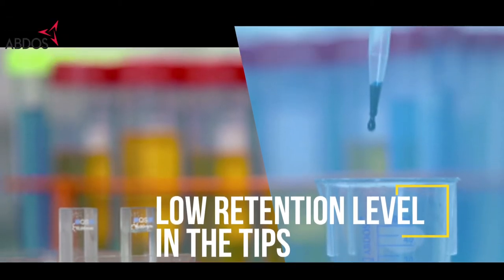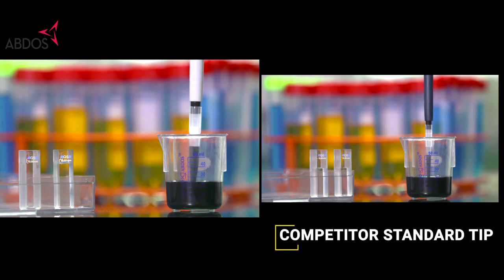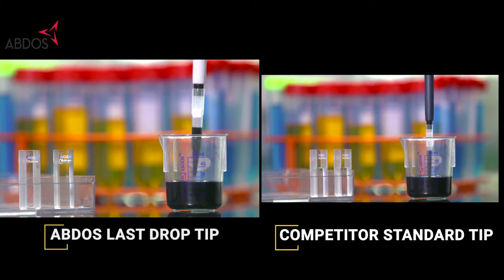The retention level is 10 times lesser with viscous samples than standard pipette tips. You can even visually observe the difference between ABDOS Last Drop low retention filter pipette tips and competitor low retention pipette tips.